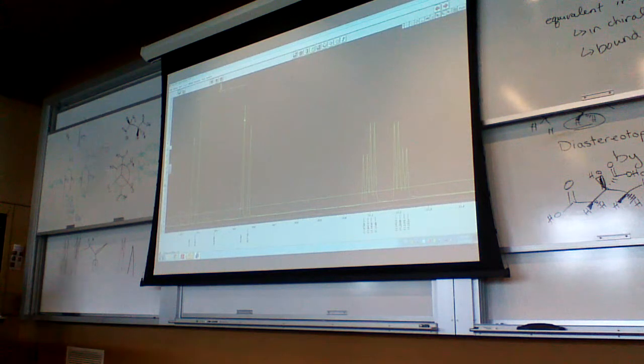So we're looking at these two peaks, here and here. That's one coupling constant. Wasn't that a number we saw before? It's close, but not quite. Are we looking at the H on the alkene or the CH2 group? The CH2 group.